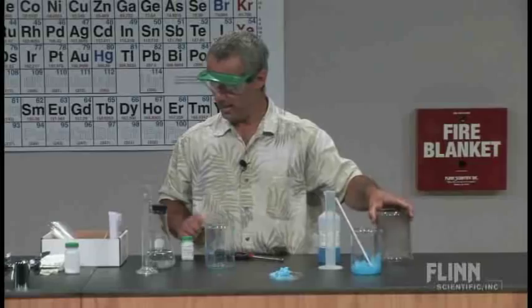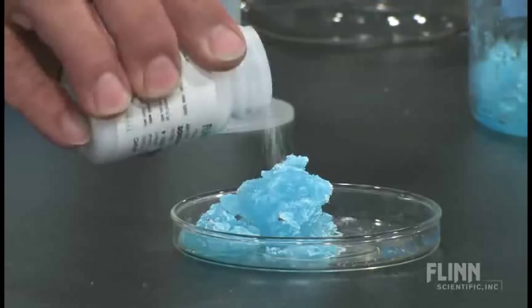We can obviously put that out with a larger beaker there and suffocate it. Nice little demonstration. It burns for a while, of course, until the ethanol gets used up. If you want to make it so you can see that flame a little bit better, you can just add some different salts. This happens just to be some sodium chloride.